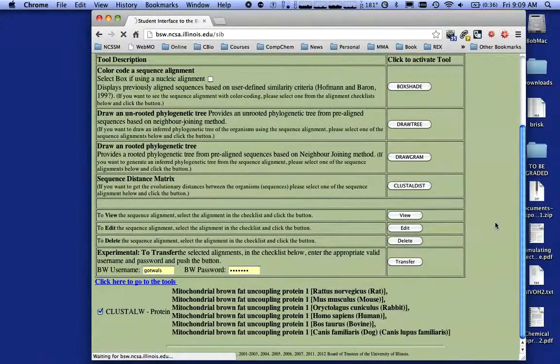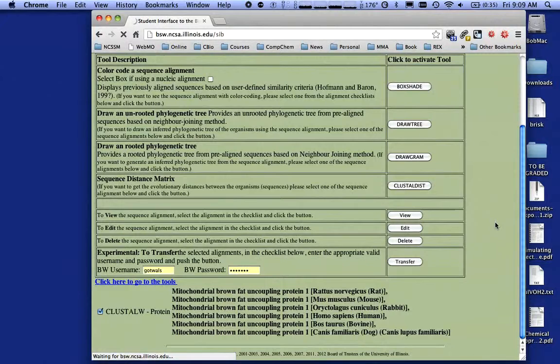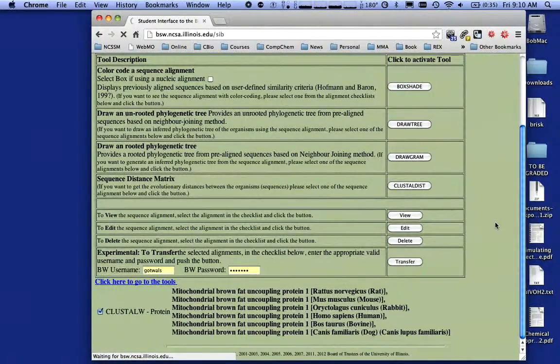If it was taking this long I would go find something else to do and come back later to look at my tree. It's usually not this slow. You are accessing some pretty complicated databases and there's an awful lot of mathematics that goes into drawing this tree, so you can't expect these things to pop up instantaneously. This is all computationally intensive work being done on one of the supercomputers at NCSA — the National Center for Supercomputing Applications — located at the University of Illinois Urbana-Champaign.